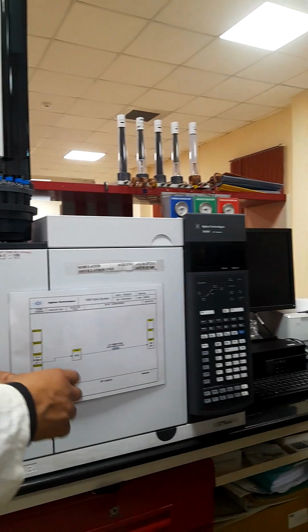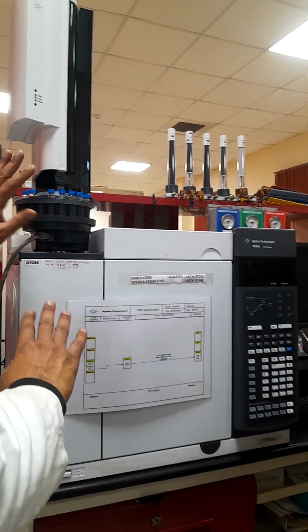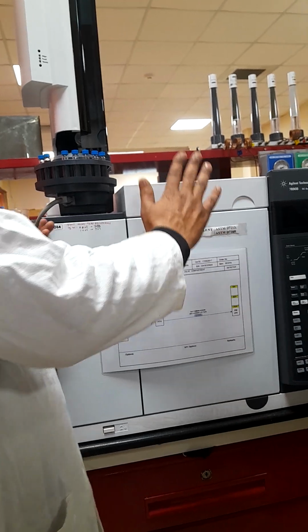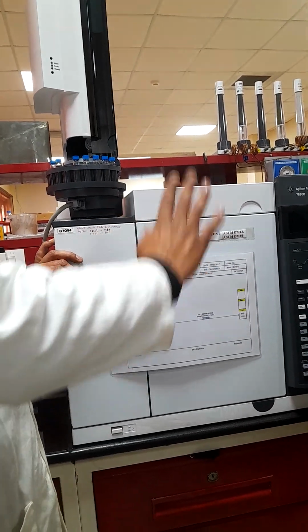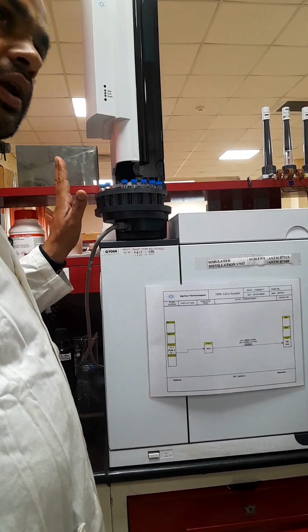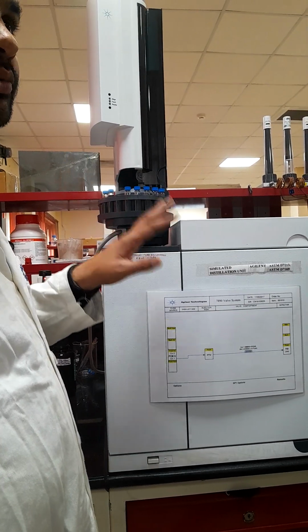Whether the sample is carried as vapor phase or liquid phase, I will discuss that point, because here we have 3 points. The detector is stable at 375 degrees Celsius, so the temperature is fixed here. We have programmed temperatures at the inlet and oven points. So what is this temperature programming?